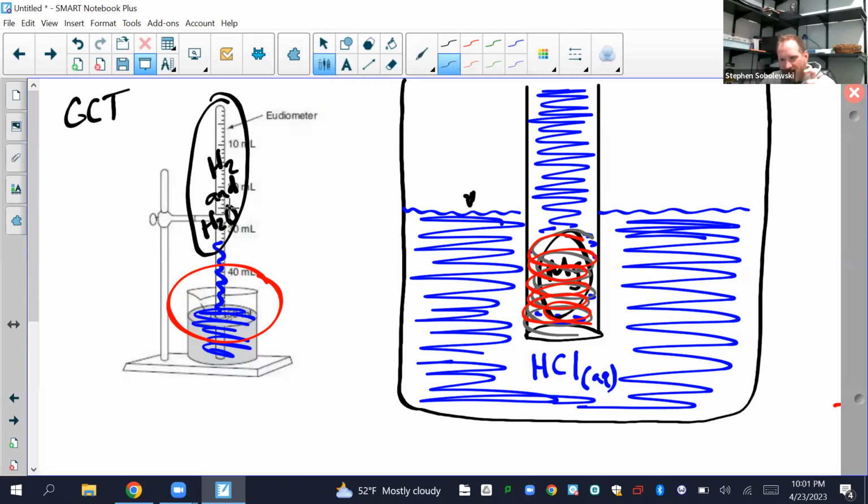Now the pressure in there will be assumed equal to the room pressure. The problem is we don't need the pressure of the H2 and H2O to plug in. We need just the pressure of the H2. What law are we getting at here? Dalton's law. See how we get to use yet another gas law for this lab.